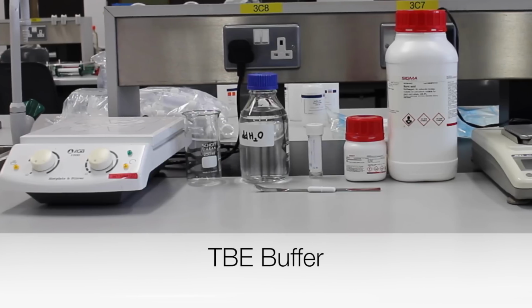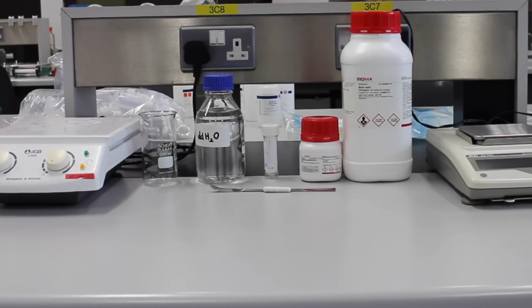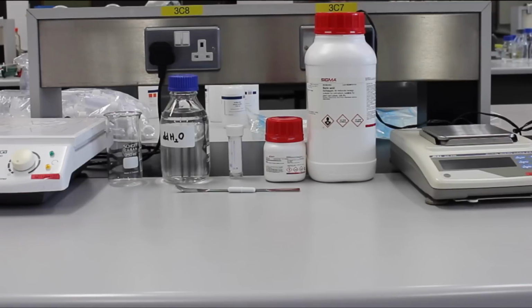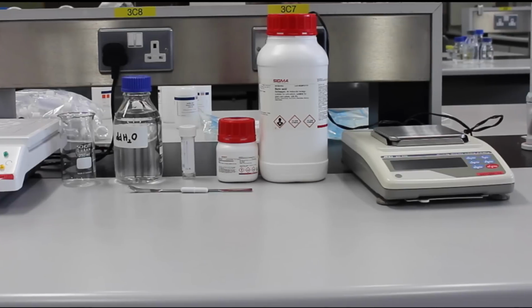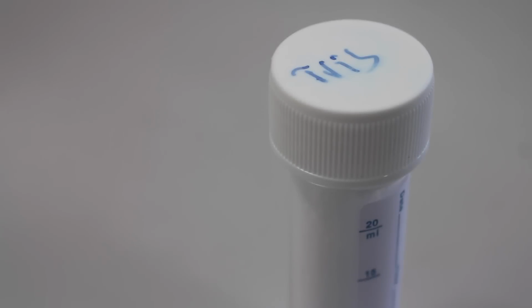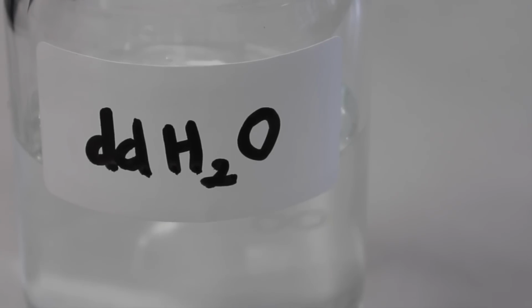Now, 10x TBE buffer is prepared. TBE stands for tris, boric acid, and EDTA. EDTA chelates magnesium. This inhibits enzymatic degradation of nucleic acid and gives sharper bands in gels. For the TBE buffer, tris base, boric acid, EDTA, and water are needed.